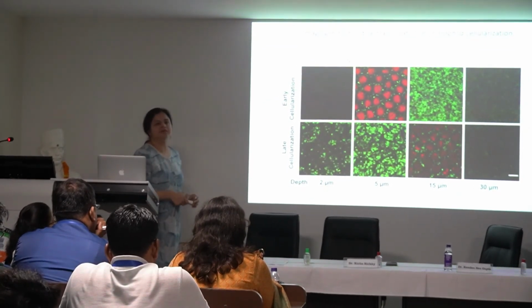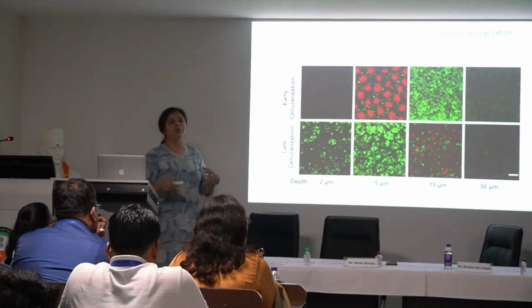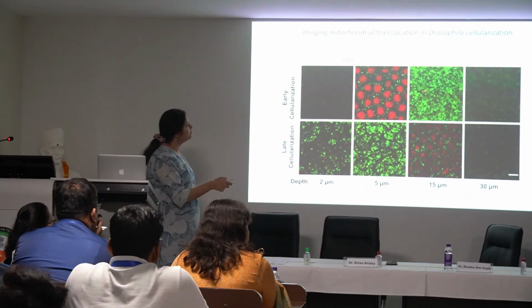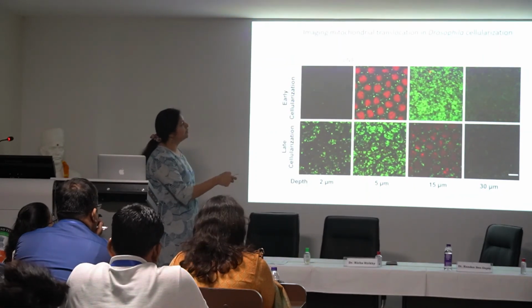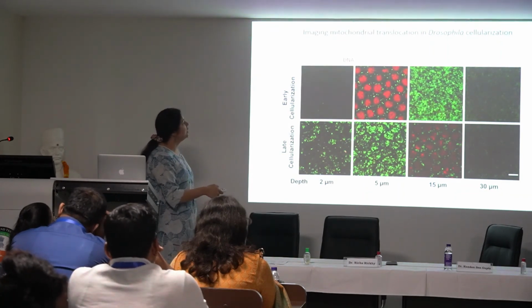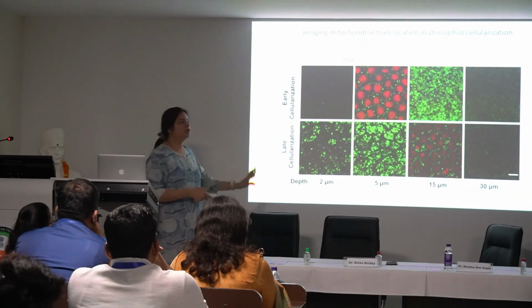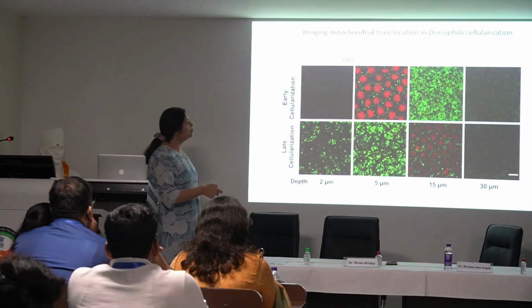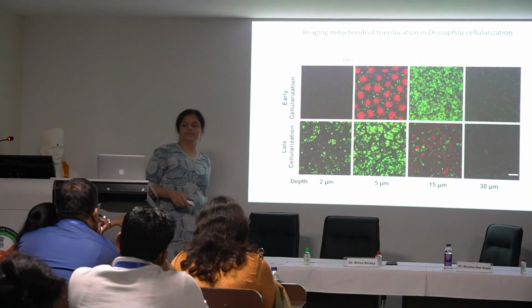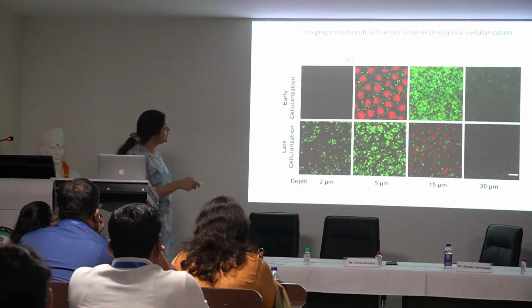So what we did next was look at microtubule motor mutants, and we showed that, for example, when we have dynein mutants, then mitochondria remain in these basal sections, and when we have kinesin mutants, then they actually translocate to apical sections even earlier. Okay, so there is a motor control of this transport. As if the mitochondria have moved even above the nuclei now, right? Yes, they have moved above. They are exactly above the nuclei.